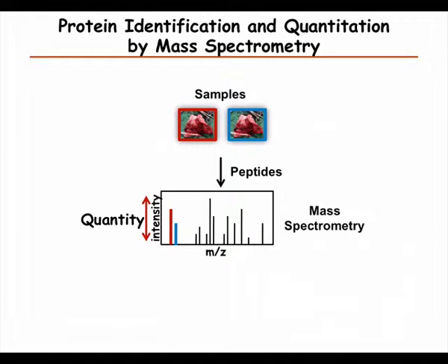So you really need to compare the same peptide sequences, or have an internal standard which has also the same sequence but heavy isotope labeled.